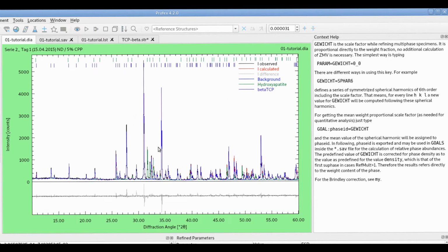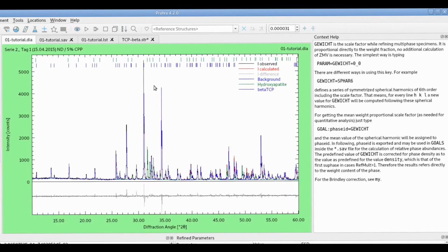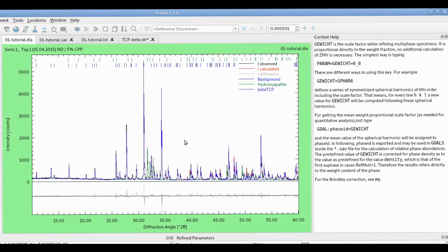So now we have to know which crystallographic parameter changes the intensity of the peaks in the measured diffraction pattern. So we have to go back and forth between direct space of the crystal structure and reciprocal space of the diffraction pattern. We have to know the link between crystallographic parameters and features in the diffraction pattern we measured.